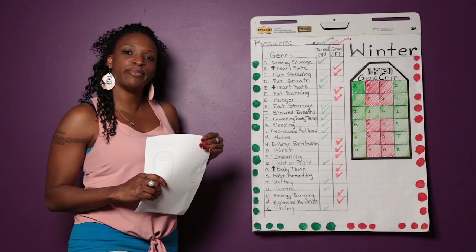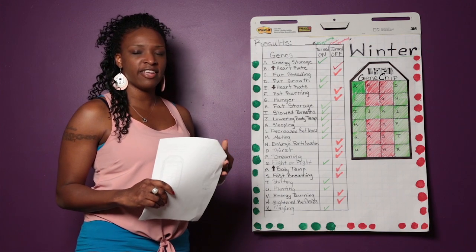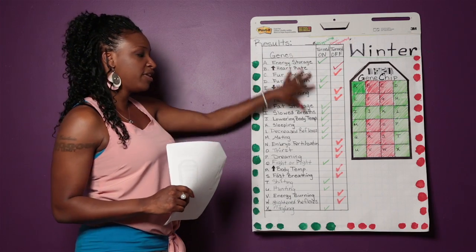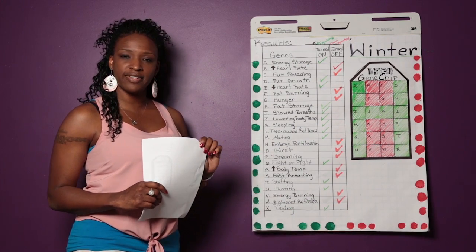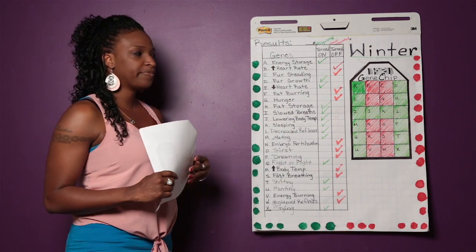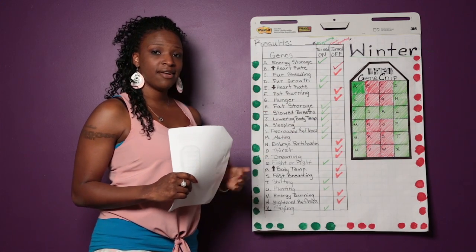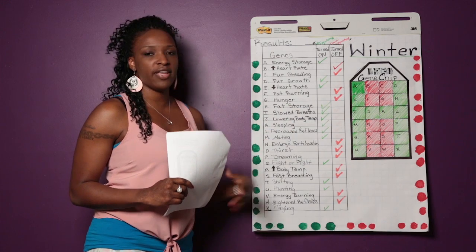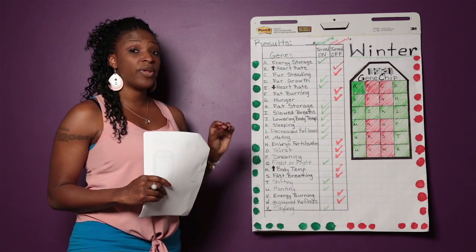Now you've taken the time to discuss with your group members which genes are upregulated or downregulated under your conditions. And hopefully you've already filled in the check marks on your microarray chip. So now I would like for you to compare your results to my results. Once again, the genes that are in green, I felt were upregulated. The genes that are in red are the ones that I feel will be downregulated in the winter.